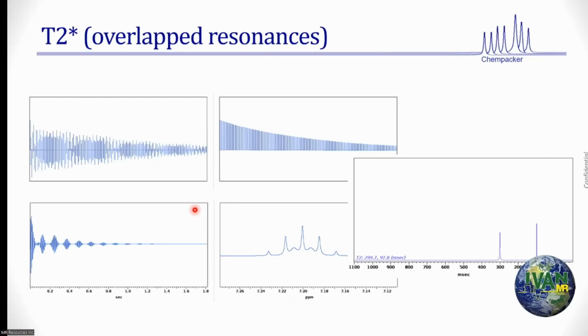So here is a FID, a synthetic FID. And if I Fourier transform this, I get this. It's a quintet, a triplet, and a doublet. There's a doublet there. There's a quintet there. How do I know? I know because I synthesized it. That's a synthetic spectrum. I added a triplet, I added a doublet, and I added a quintet on top of each other and generated a spectrum.